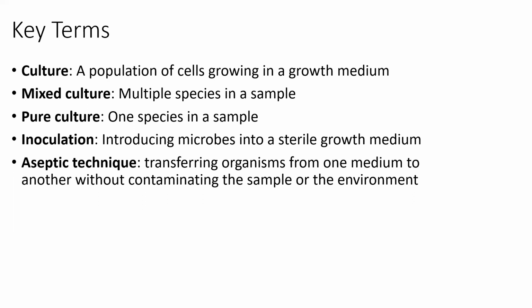Okay, so you would be taking bacteria from a culture I give you and putting it into a new media. That process of transferring microbes from one culture to a new media is called inoculation. Okay. So again, you're taking microbes from a test tube I give you and introducing them to a sterile media so that they can grow.